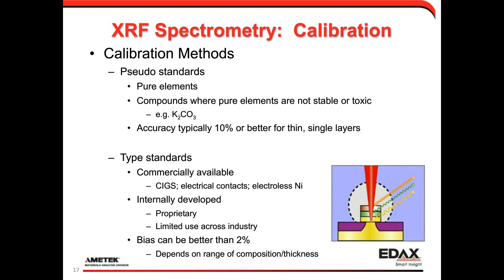They will also make hard-plated standards. Hard-plated standards tend to last longer, but they're very specific to one particular coating stack. Metal foils are stackable, so they're flexible in what kind of a coating you can build up, but they tend not to be as durable, because when you've got 1 micron gold foil, it tends to be a little bit delicate.